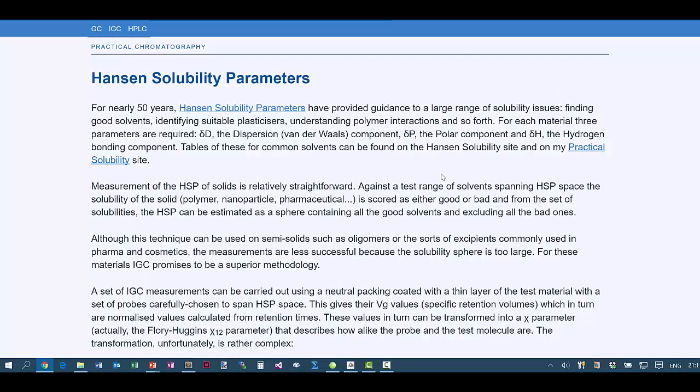So, here's the app. It explains a bit about Hansen solubility parameters, where we want to measure DD, the dispersion, DP, the polar, and DH, the hydrogen bonding component.